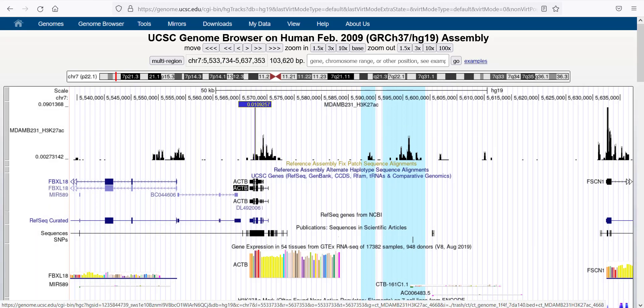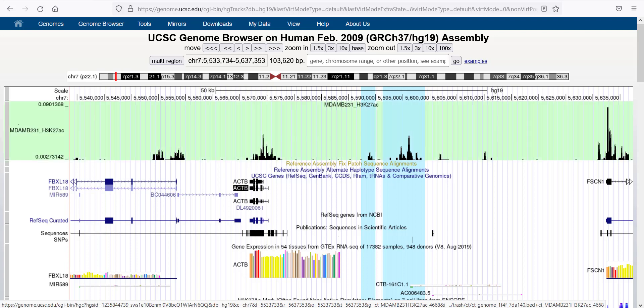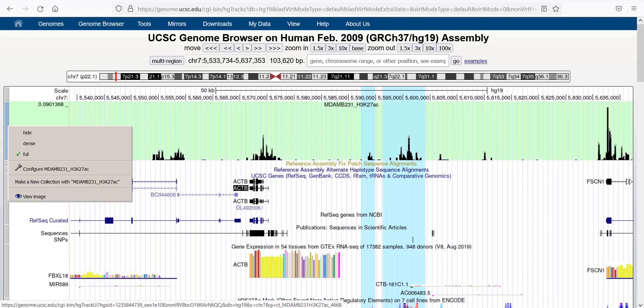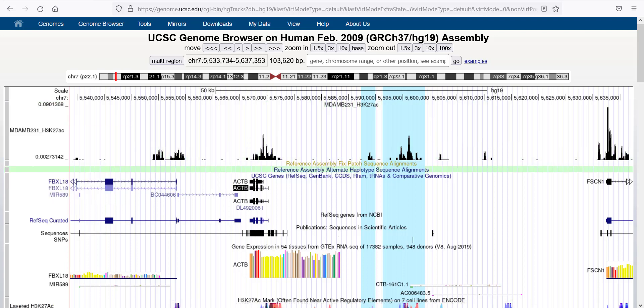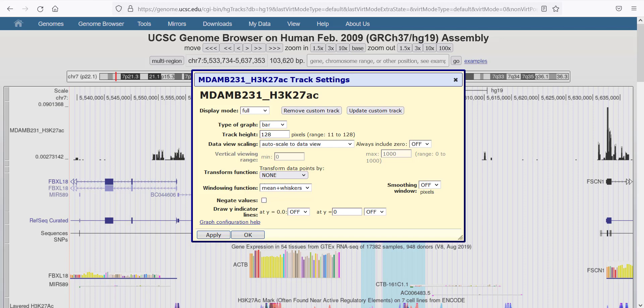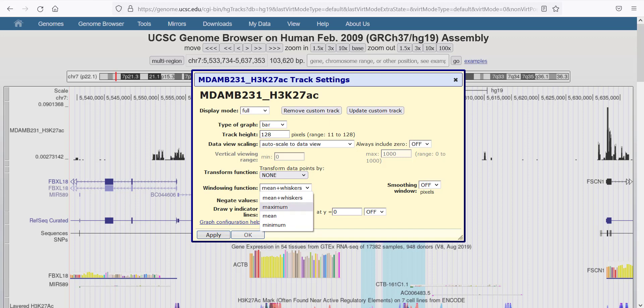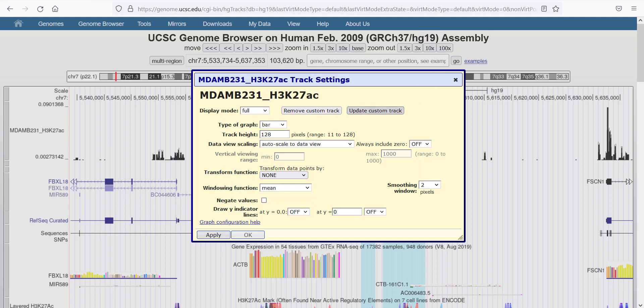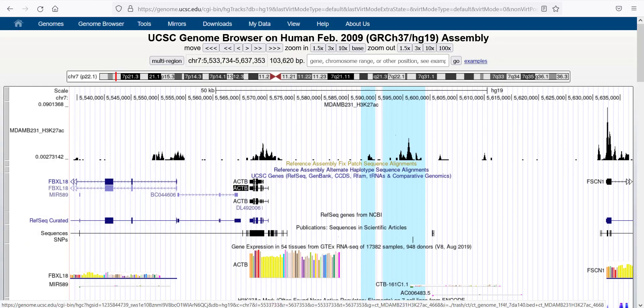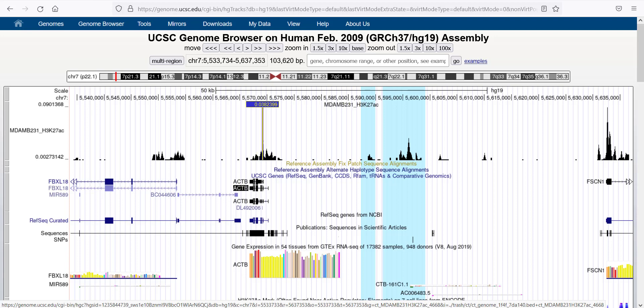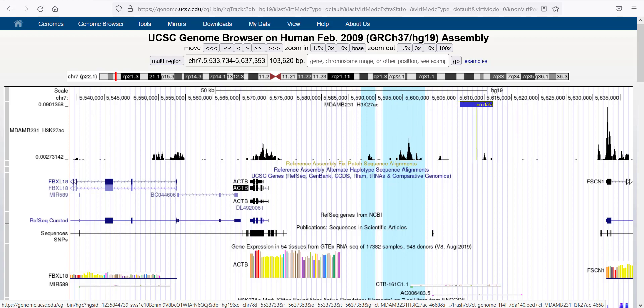You can also change the smoothing by adding a moving average. If you go back and right click on this and configure, you can then use mean whiskers or just mean itself. You can also add some smoothing, for example 2 pixels and then click OK. This will show you the different distributions of H3K27 across the genome in this specific case.